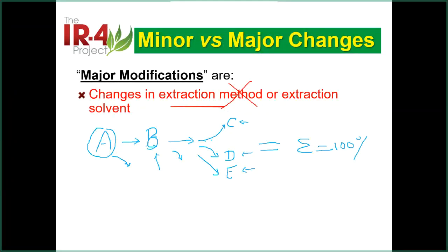Okay, so in this way, you know this is exactly this chemical A going into your sample. Now if you change some method, because they use different methods here, maybe using shaking, grinding, and so on, then you know this is part of there. But if you change any step in between, you will get a different number. You never know.